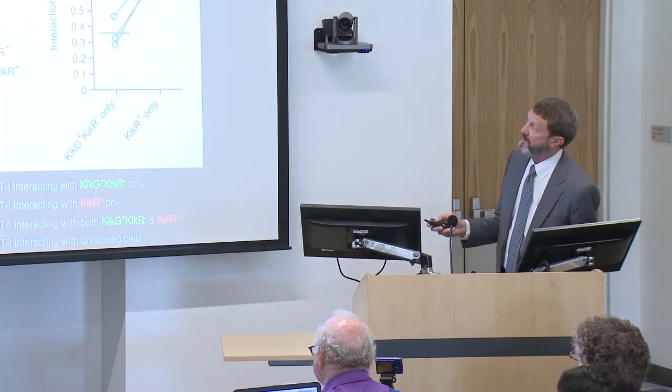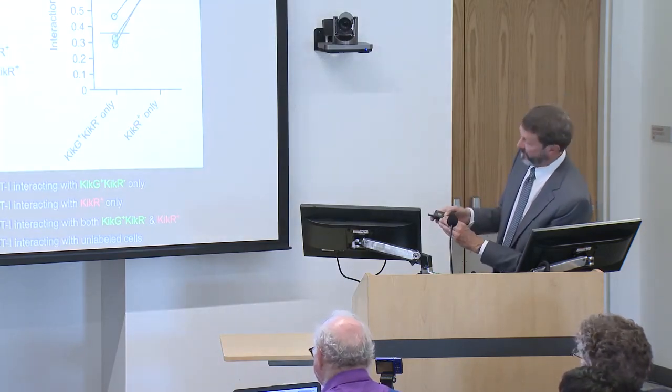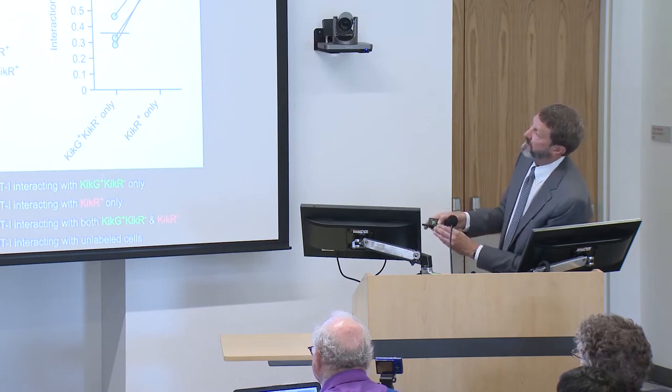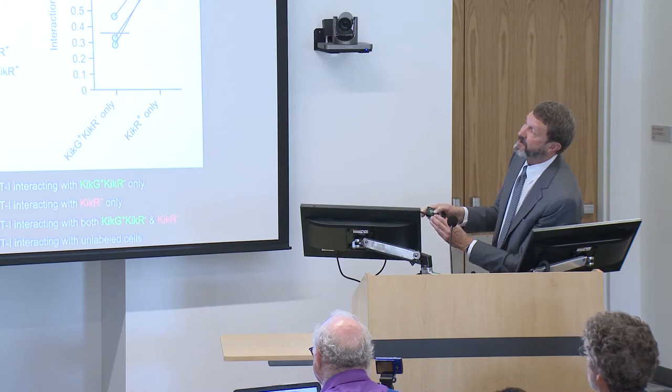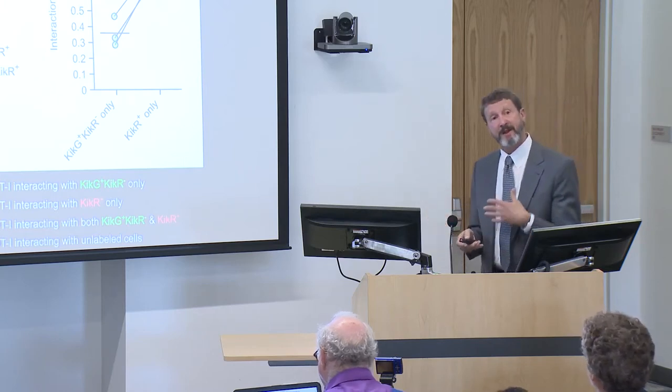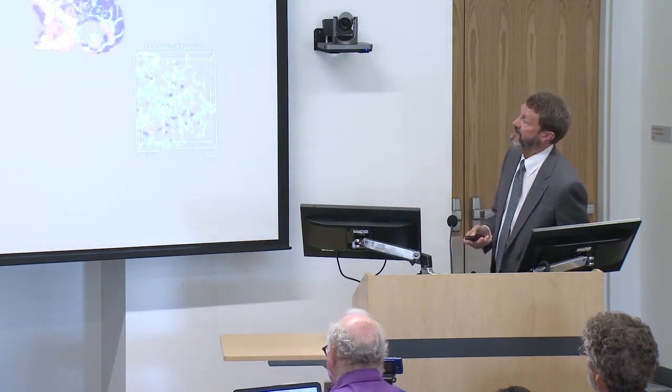And what we're hoping to do is to carry this on further. As you can see, most of the interactions are taking place with the cells that have migrated in from the periphery. Very few of them are happening with the cells that didn't come in from the periphery in mounting that response.